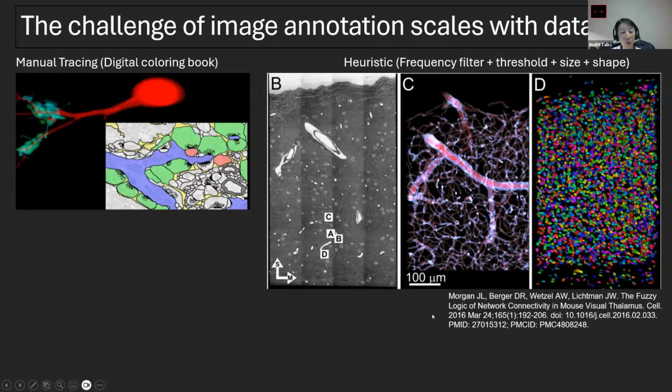I also have a question about when you mentioned you get poor quality images when you were pre-screening. So what are the causes for getting poor quality images? From sample processing or image acquisition? So the main problem that we had is stigmation drift. So these are images acquired on the Merlin, which the Merlin scanning electron microscope is really nice because it has a lot of flexibility for different kinds of imaging, but it's not necessarily the most stable beam or column in the world.